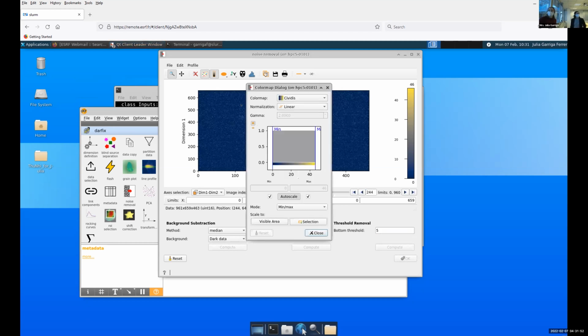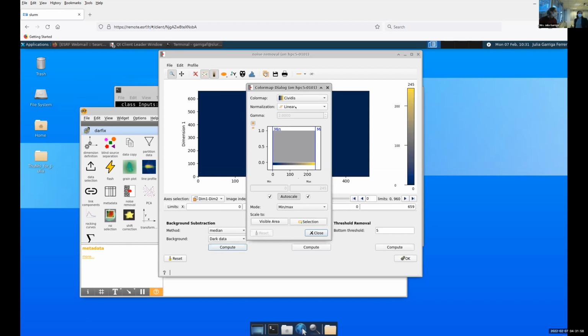I don't know if we can move. Actually, the one in the presentation was the mosaicity. No, the dataset with the corrections was the strain. The mosaicity map was the mosaicity of the grain.